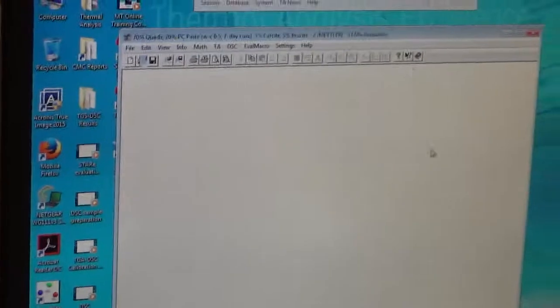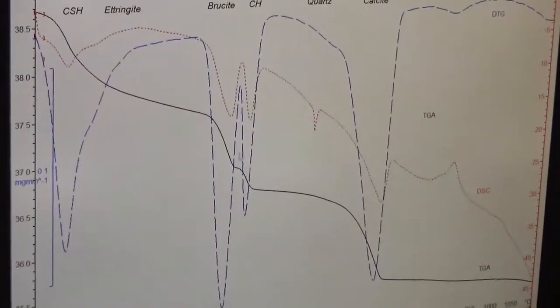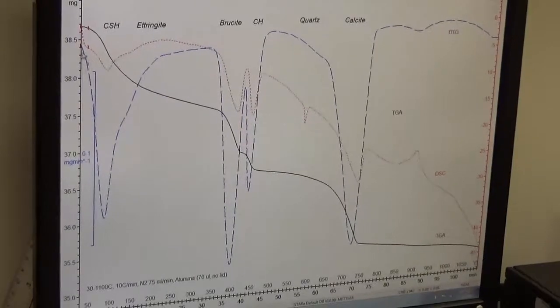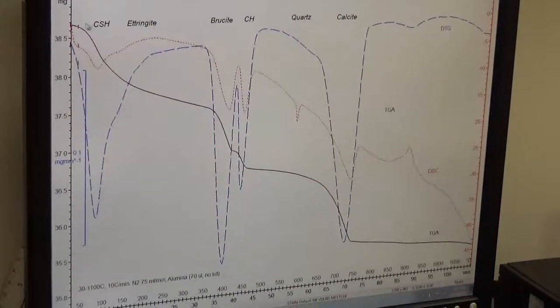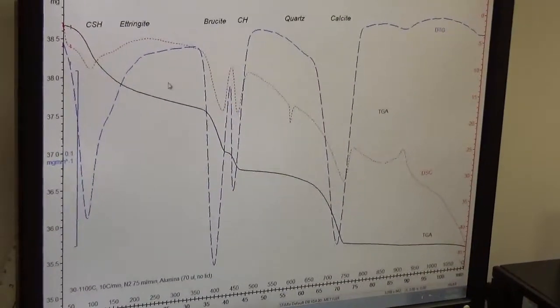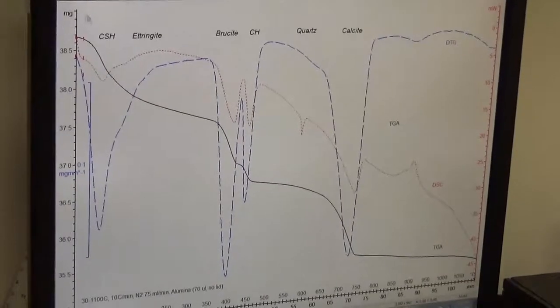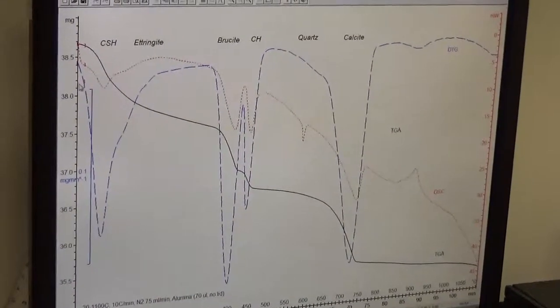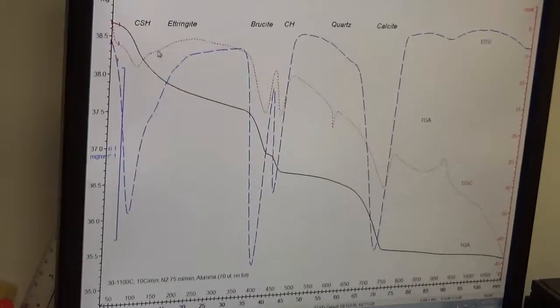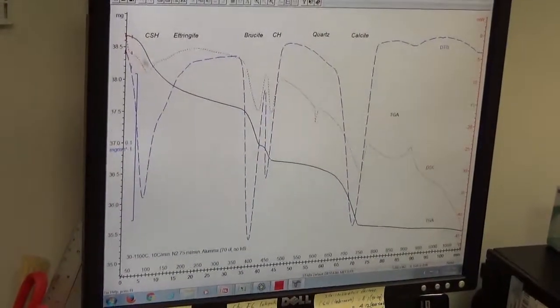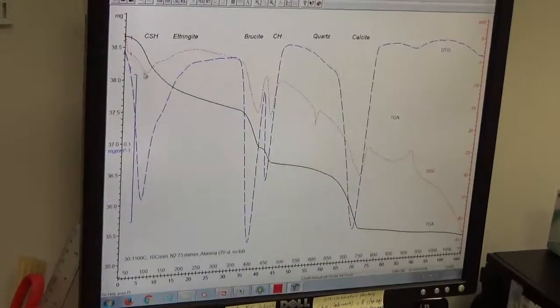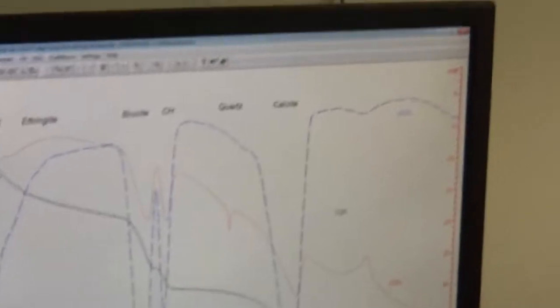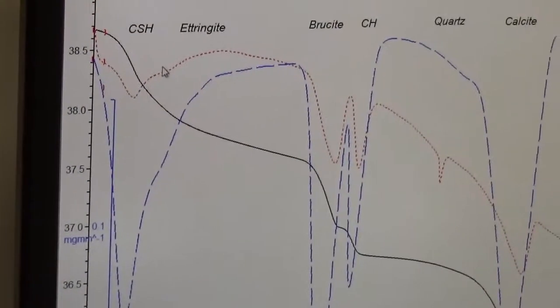When I open that standard, it shows the different plots. The black one is the TGA plot. The blue dashed line is the DTG — the first derivative of the TGA plot. A change in weight in the TGA plot shows up clearly as a downward peak in the DTG plot. The dotted red line is the DSC plot. So the black one is the TGA, the dotted red one is the DSC, and the dashed blue one is the DTG. The DTG and DSC plots are more or less similar — they both show the downward peak, but DTG shows it more clearly.